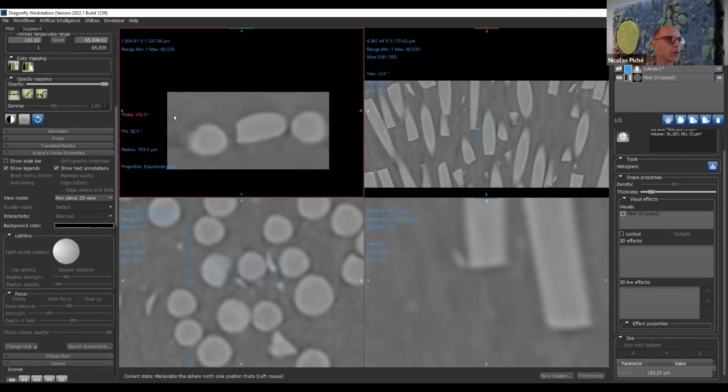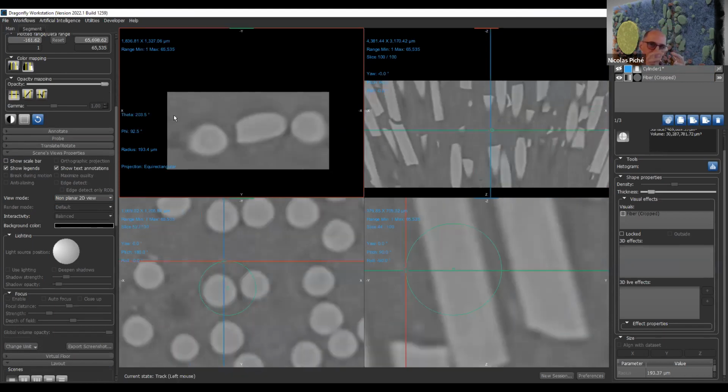Not always practical, but let's say that you have a spherical object and you want to understand what's happening at the surface, you can do that. And now I can export that view, that slice that I'm looking at, as a proper data set. So you could unwrap a can, let's say a Campbell soup can, and see the Campbell sign. Yeah, so you would have your tomato soup unwrapped like if you had cut the paper on it. On a sphere, it's a bit different, but let's say you would see the map mode expressed like that.